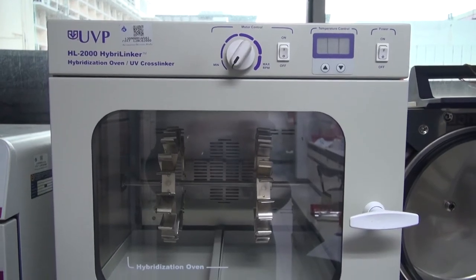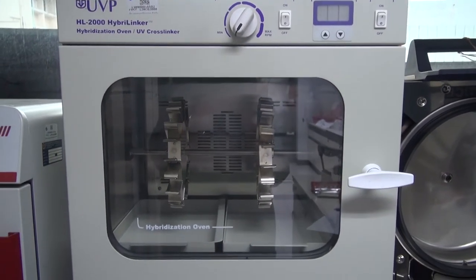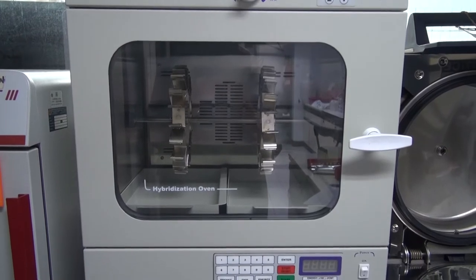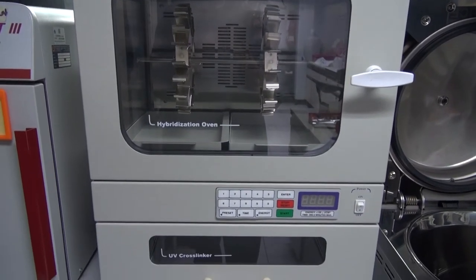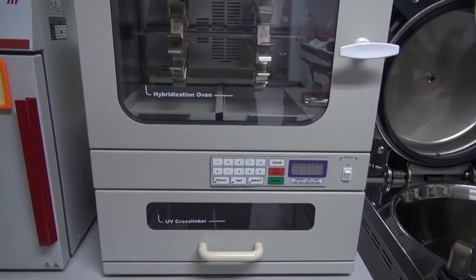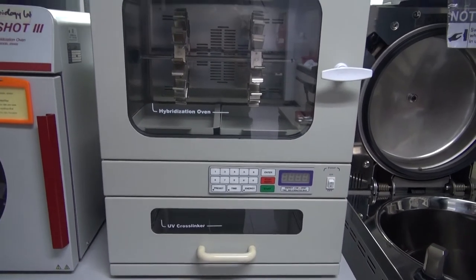Hi everyone, today I would like to demonstrate to you how to use the UVP hybrid linker. This system provides a combination of hybridization oven and a 254 nanometer UV cross-linker.